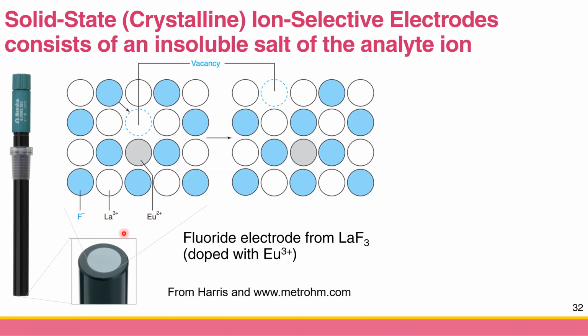For fluoride detection, they use something called lanthanum fluoride, LaF3. Now lanthanum fluoride is an insoluble ionic salt. By the term insoluble, it can actually dissolve in water a little bit, so you may want to avoid them being in contact with water.